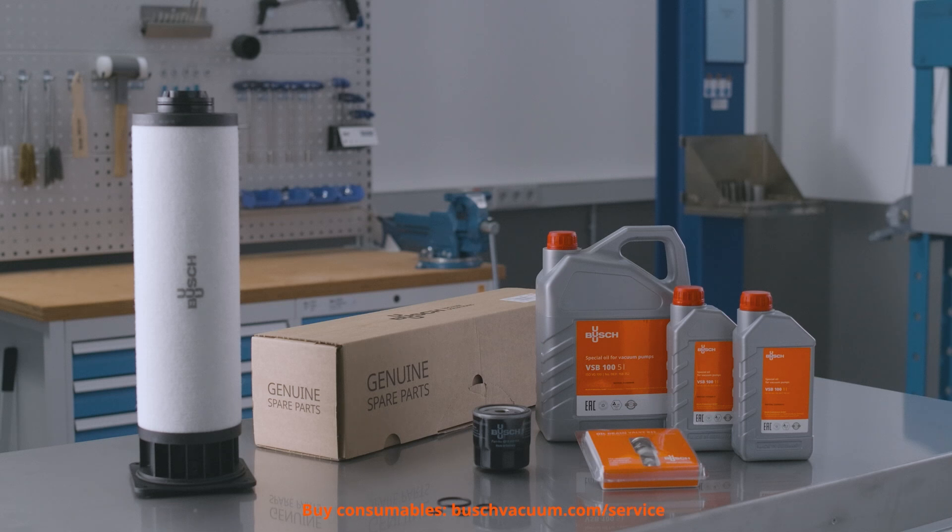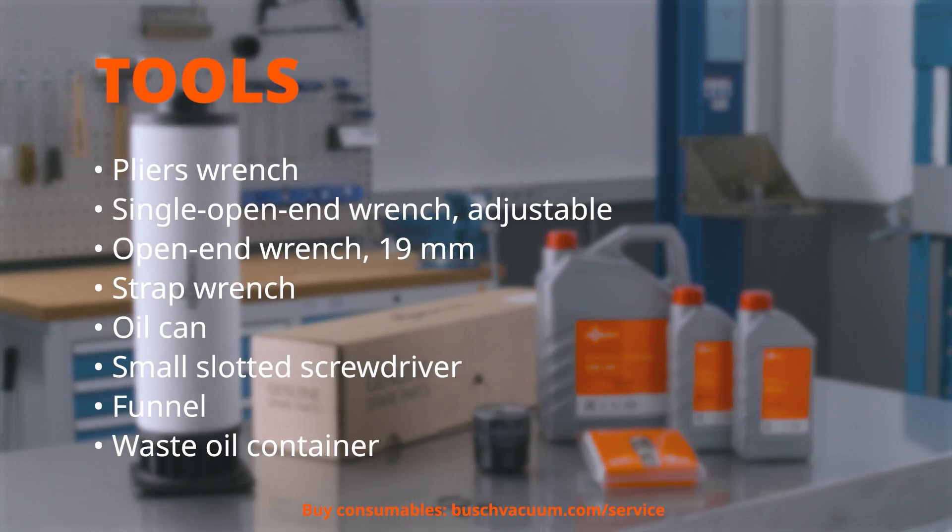We need Busch genuine oil and oil filters as well as the Busch oil drain valve kit. And of course, we need some tools: pliers wrench, single open-end wrench adjustable, open-end wrench 19mm, strap wrench, oil can, small slotted screwdriver, funnel, and a waste oil container.